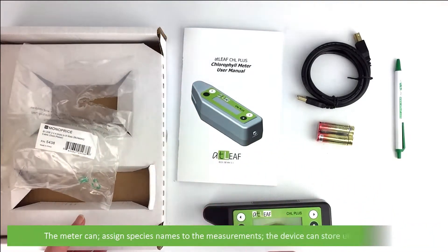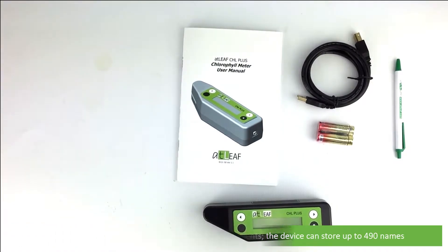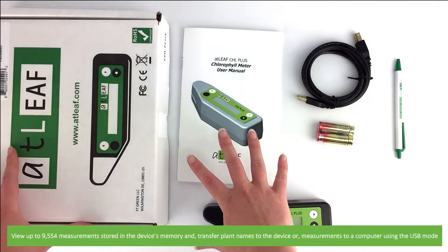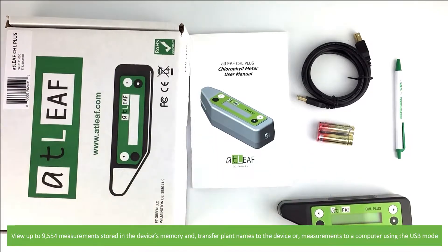The meter can assign species names to the measurements. The device can store up to 490 names, view up to 9,554 measurements stored in the device's memory, and transfer plant names to the device or measurements to a computer using USB mode.